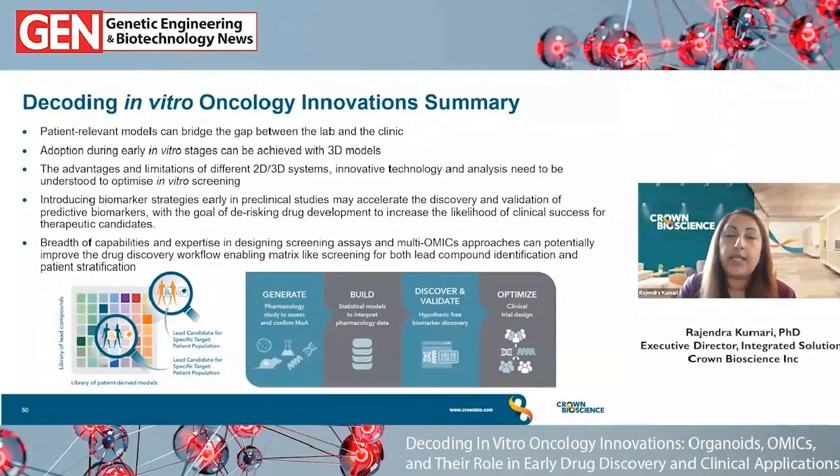The advantages and limitations of the different 2D and 3D systems, as well as the different innovative technology and downstream analysis, also need to be understood so that the in vitro screens can be optimized. Introducing biomarker strategies early in preclinical studies also has many advantages, but critical is having the expertise in designing the right screening assay using those different 2D and 3D systems or patient-derived models, as well as multi-omics approaches, so that the right drug enters the clinic for the right patient.